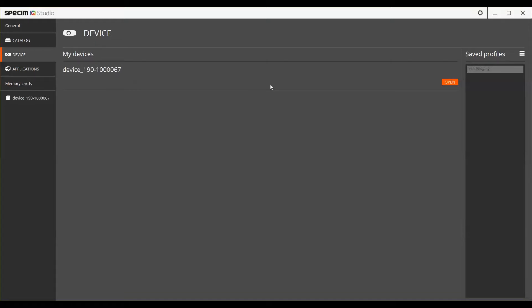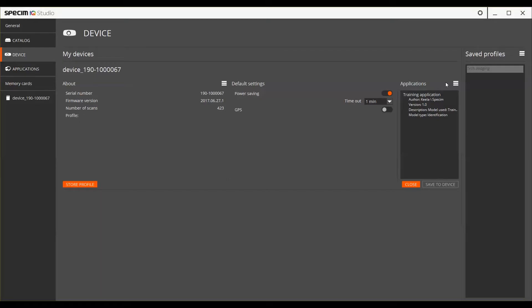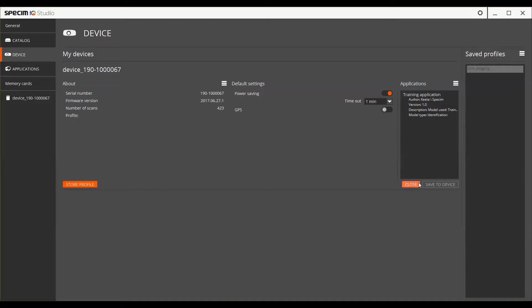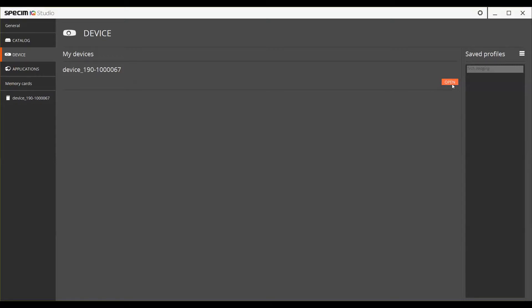All of the cameras that are connected to your PC will be listed under the My Devices section. Pressing Open allows you to access the Settings view. Selecting Open will open up the Settings view. In this view, you can see the list of applications that have already been installed into the device and the current device settings.